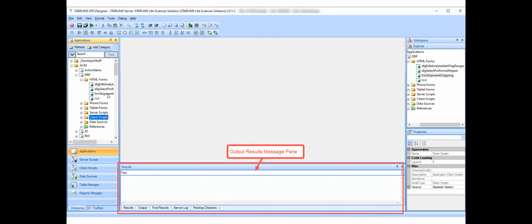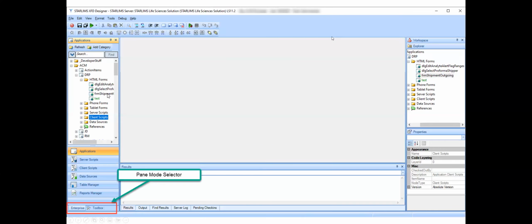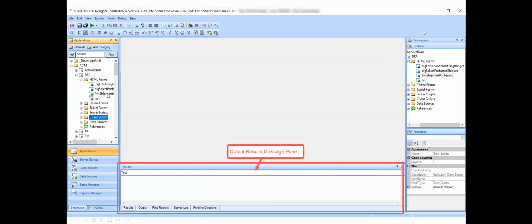So, a short example of that would be to come, let me see if I can stop this. One moment, I'm going to stop the recording for a moment because this auto forwarding situation's got to stop. My bad.